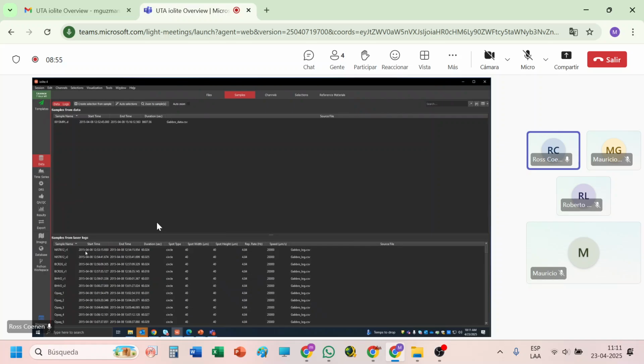So this shows all of our different samples that we ran with the names. In order to have these names here, they need to be named in the laser software. And then that will hold the names with that log file that we just imported. So it just makes data reduction quite a bit easier. And so from here, we're going to make what we call selections. Selections is kind of another way of saying peak integration. So we're basically taking this data and giving it a name.